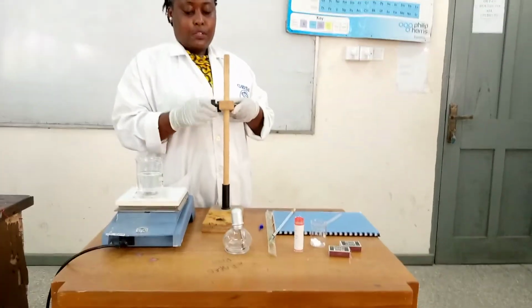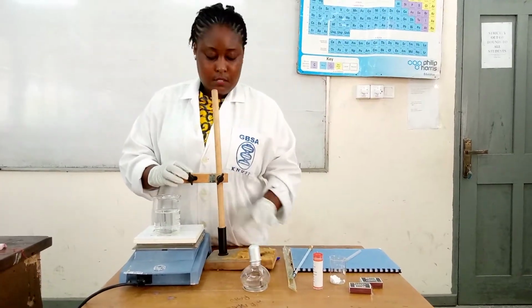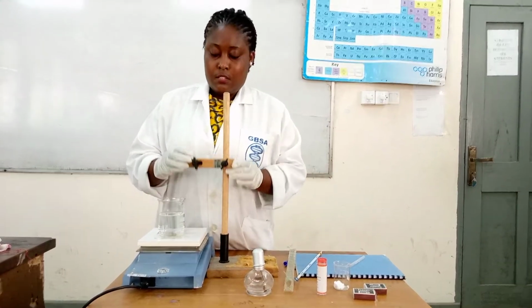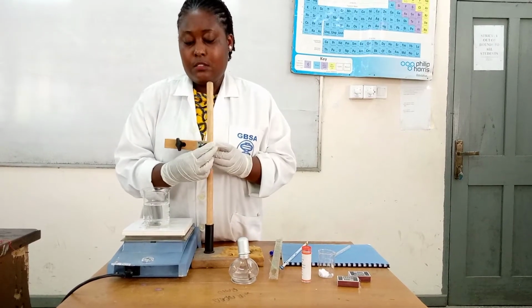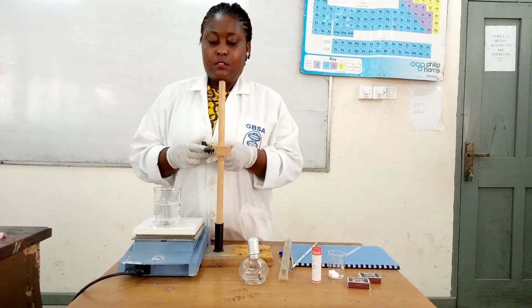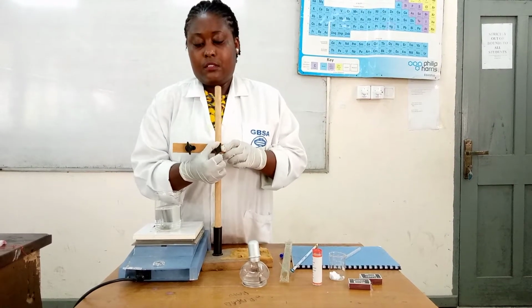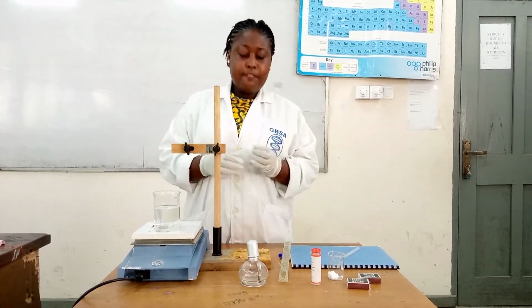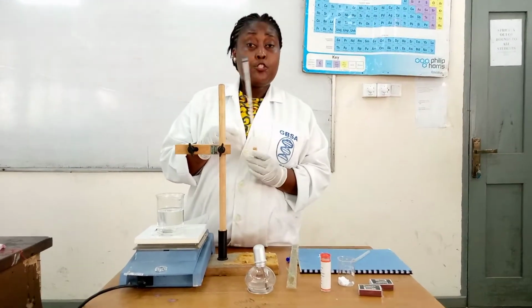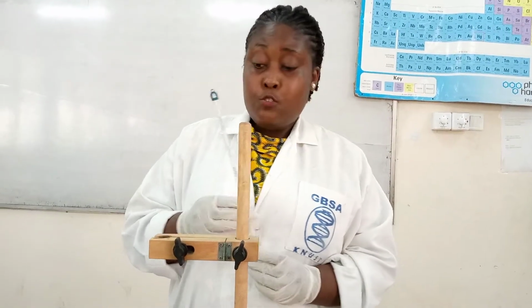Okay, so you bring this down, like this. You can adjust it to any length you want. Okay, so let me bring it, then we tighten it. Alright. Okay, now I can fix my thermometer and the sample. Now the calibrations on the thermometer should face you, the person working, because you are going to read the temperature, so it should face you.